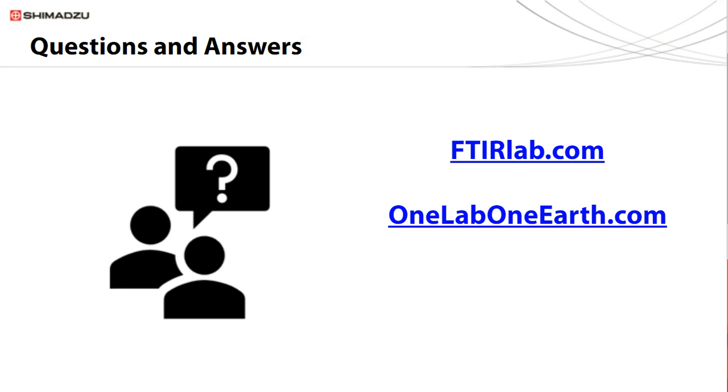Okay, we have the next question, and this time it is for Sudhir. The question says, I was curious how hard it is to search for a single particle, say of about 20 micron in size, under the microscope. Okay, I can see how this would be challenging when one would try to find a micron-sized particle under the high magnification of measurement optics. In our case, the microscope was equipped with what we call the wide field camera.